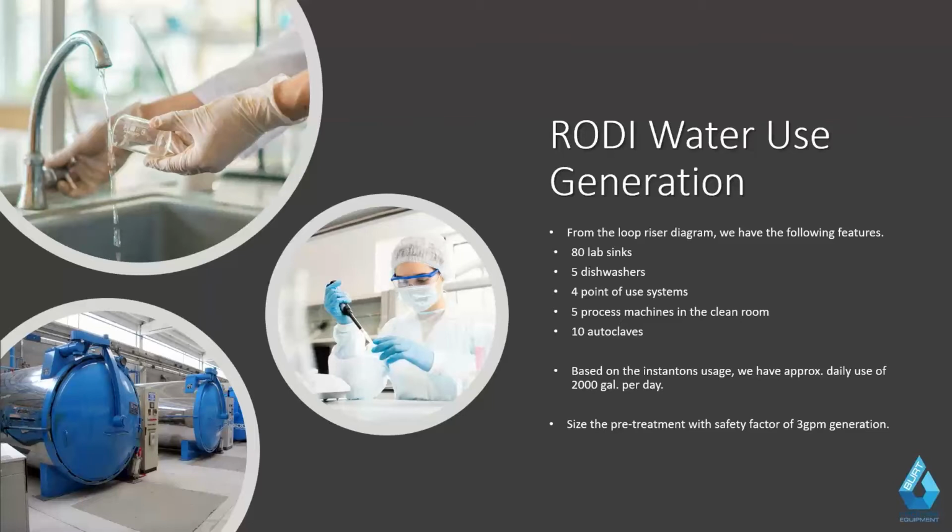You're probably talking about a diversity usage between lab sinks of maybe a couple hundred gallons per day. Things like your dishwashers will be heavy. Process machines in the clean room will be the heaviest users of the water. Every one of those machines will probably be pulling a couple hundred gallons. And again, you typically want to oversize your RO just a little bit in those cases. And 2,000 gallons per day is not considered a very high rate.